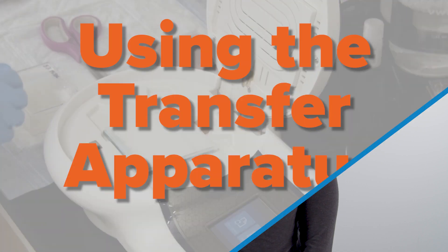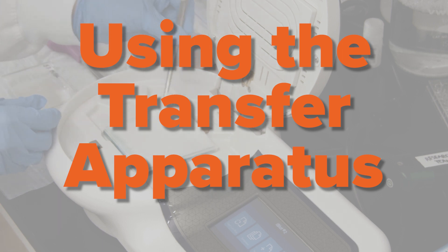The next step is transferring the separated proteins from the gel to a membrane such as PVDF or nitrocellulose. This is done using a transfer apparatus. Transfers can be done using a wet, dry, or semi-dry assembly. Each procedure is slightly different, but all involve creating a transfer sandwich of a membrane, gel, and absorbent blotting paper, then passing an electric current through the sandwich to migrate the proteins from the gel to the membrane.